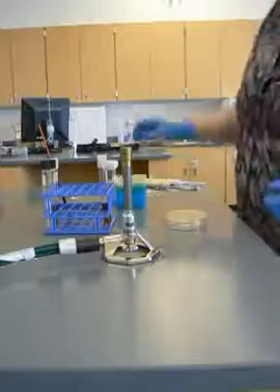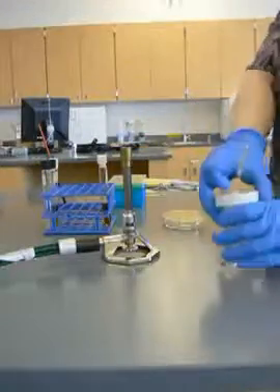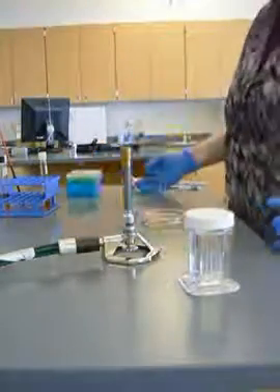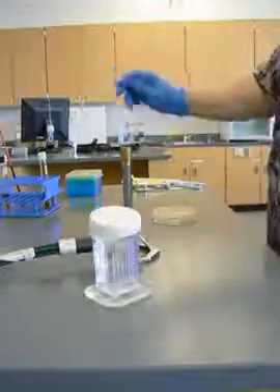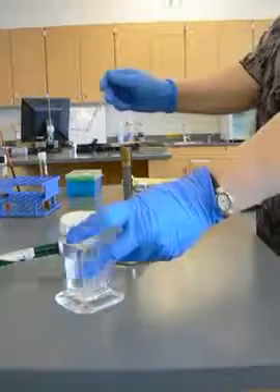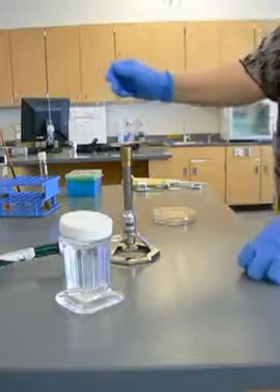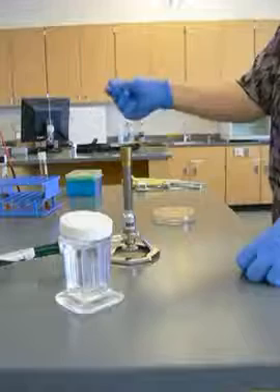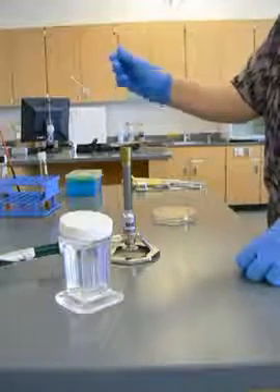Now I'm going to sterilize my hockey stick for spreading out my inoculum. I'm getting everything that's potentially flammable out of the way. I'm going to sterilize my glass hockey stick. You can see where the flame has been — everything is all nice and sterilized. The flame has been on the entire bottom of the hockey stick.